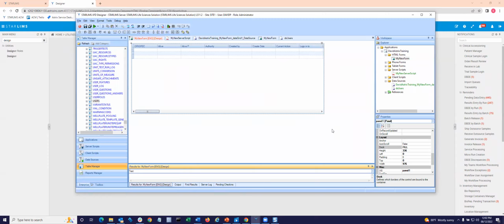I'd actually like to hear some statements about your perspective on how this looks. On a scale of 1 to 10, do you think it's complicated? Is it overly complicated? Or how much more detail do you think we need to go into for the overview here? Any comments about that?